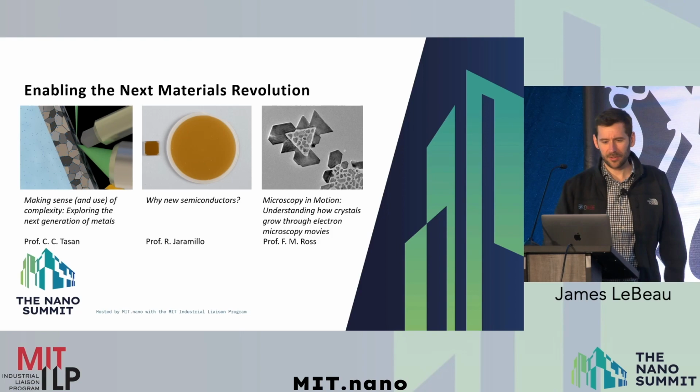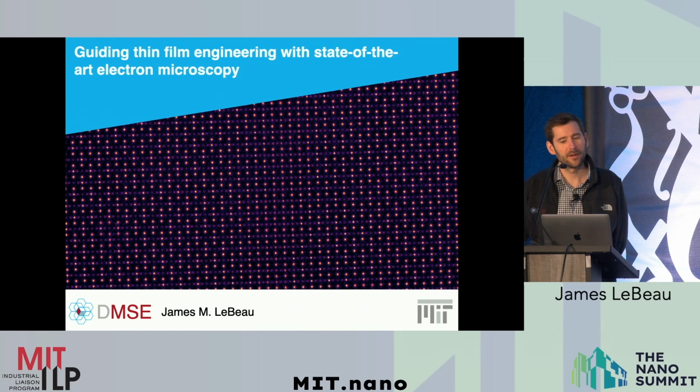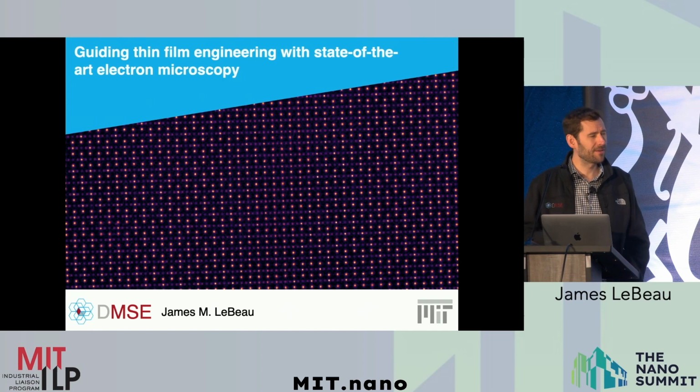So I'm going to talk about guiding thin film engineering with state-of-the-art electron microscopy, particularly a new technique, a new old technique called electron ptychography that allows us to reach incredible resolutions and really access information about materials that we've only dreamt of in the past and previously.